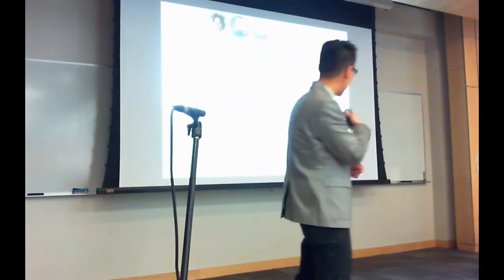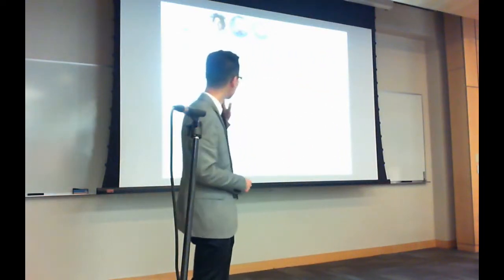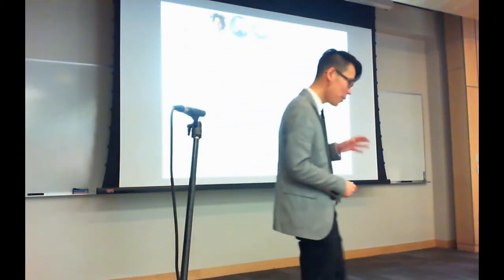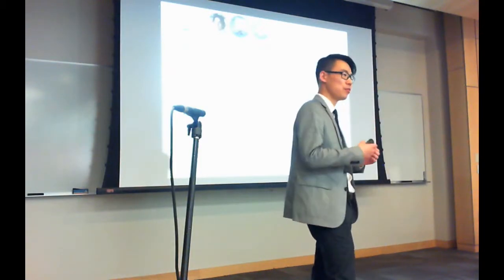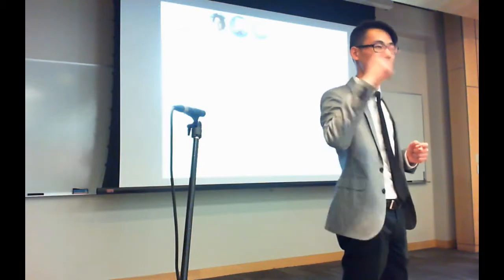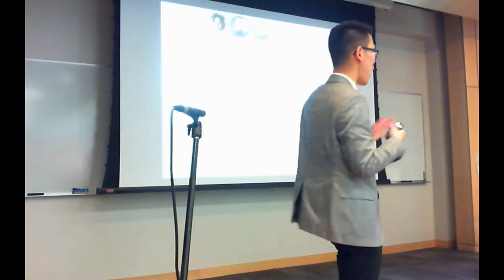And further, the reliability of the score of an identification should reflect first, the quality, how well the data within one particular spectrum is explained by a peptide. And number 2, it should also reflect the reliability of the metadata.